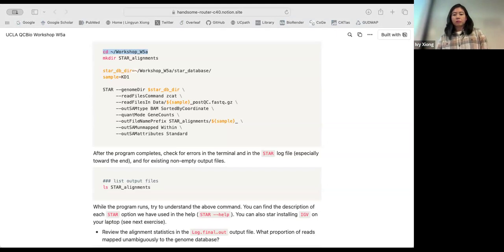Can you log into Hoffman more than once, in parallel? Yes. So maybe I do that. While it's running, you can do nothing, so if you really need it, you can open a new window. We have two things to do here, one was SC1, one was KD1. So here we are on one window. You just open another one and then log in. Usually you can open up several windows, fine.